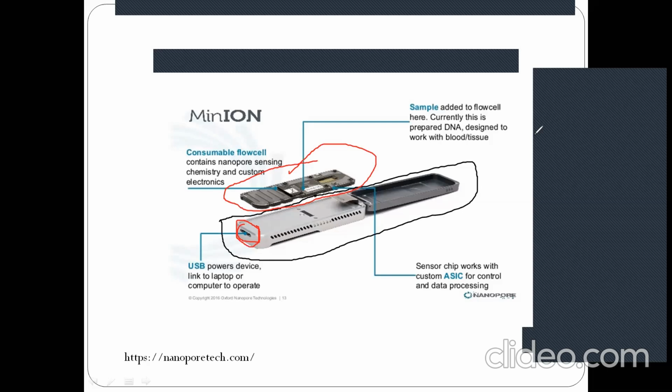Basically, as I said, this flow cell has a shelf life. Once you purchase this combination, it costs around 1.5 lakh. That will give you a maximum of 50 sample runs. And this flow cell, as it is based on nanopore technology, has several nanopores on its surface.